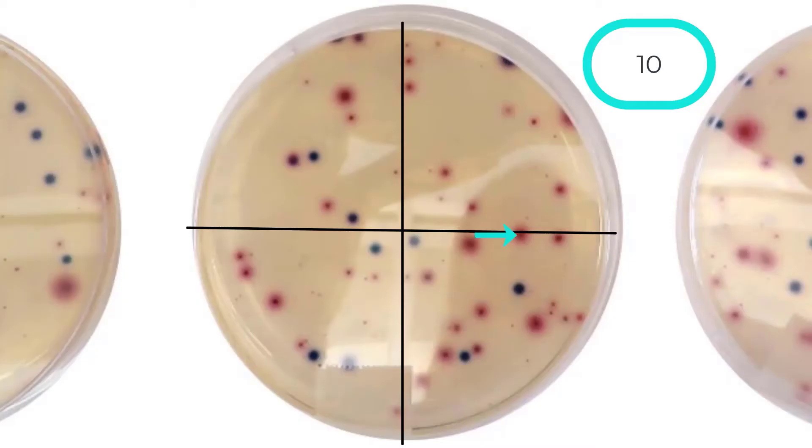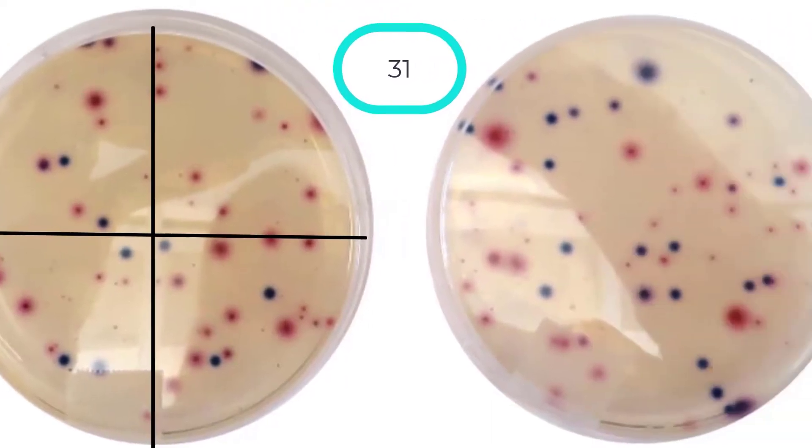A rule of thumb for deciding which colonies to include: look for colonies that have a darker colored center surrounded by a lighter halo. Some colonies not included in the count are yellow-brown colonies. Continuing to count the rest of plate 2 from 9 through 31, there are 31 other coliform colonies on this plate.